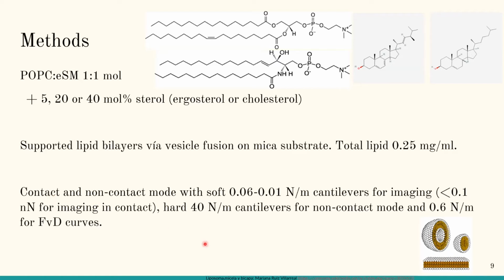We used both contact and non-contact mode. And of course, we used the force versus distance curves. To analyze the force versus distance curves, we also used an in-house program to analyze breakthrough force, which I will get to in a moment.